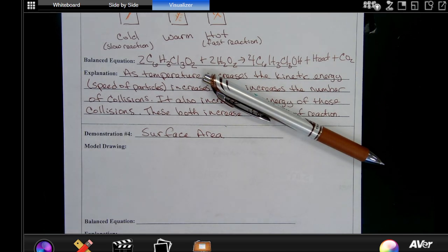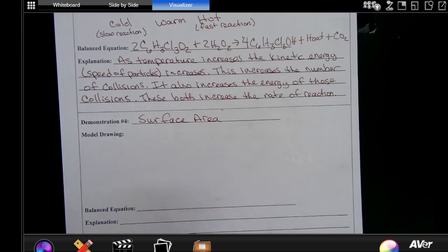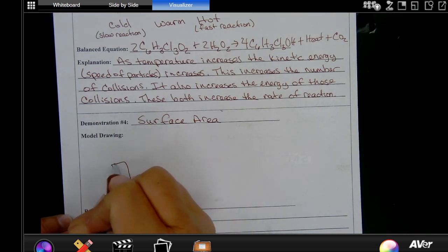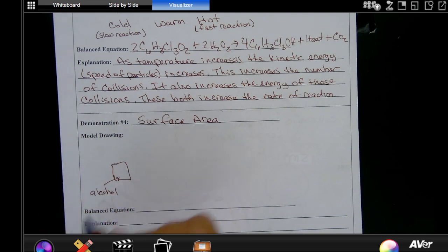All right, so I'm going to do two things here. The first thing I'm going to do is I'm going to have a beaker, okay? Just a small beaker, and I'm going to place inside it some alcohol, just isopropyl alcohol, like what your parents clean your wounds with. You know that stuff sometimes they put on your wound and it really stings, hurts like heck. Hopefully they haven't done it. My mom used to do it all the time, okay?